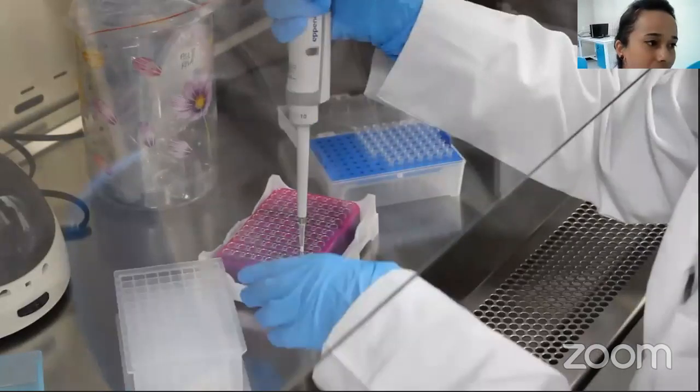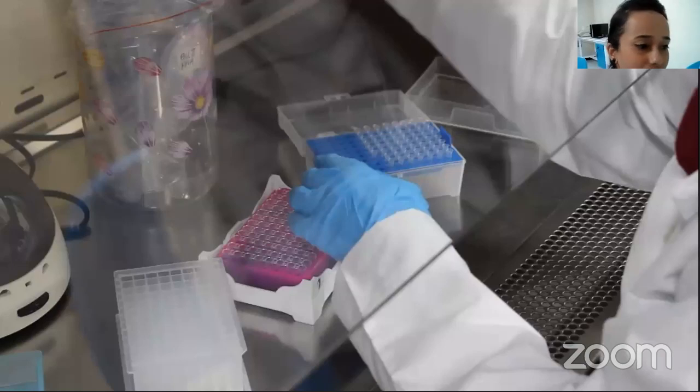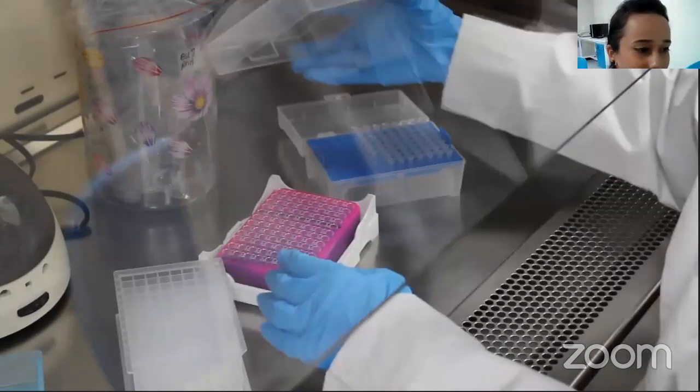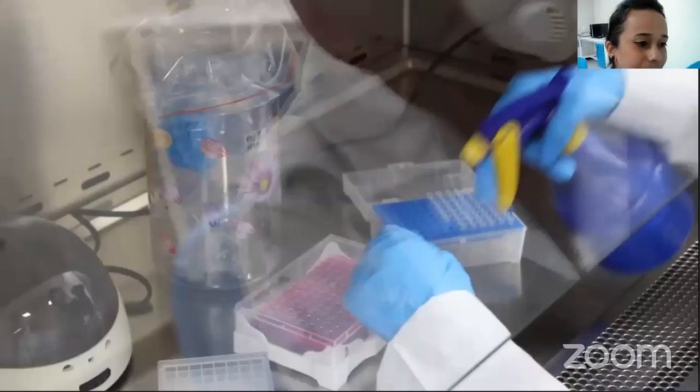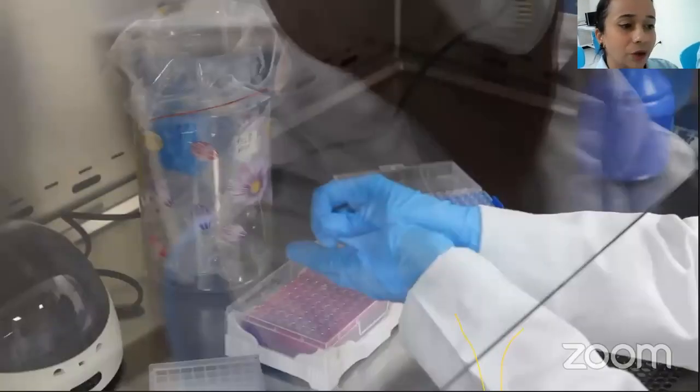Like here, the worker actually touched her tip with her glove. So first thing would be to cover her plate, because she needs to protect her samples, especially the PCR plate. Now she will be spraying her gloves with 70% alcohol. She's taking off her outer pair.